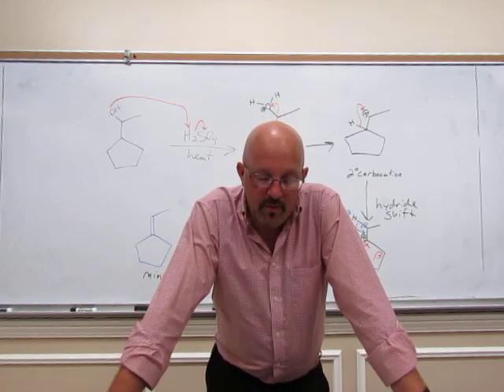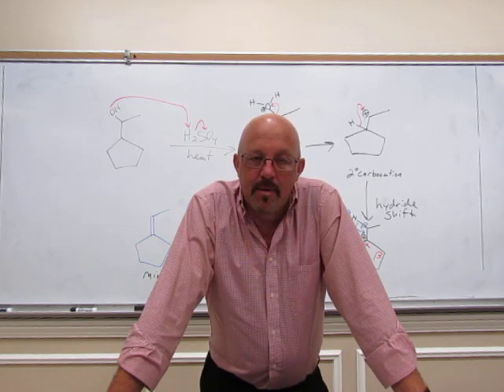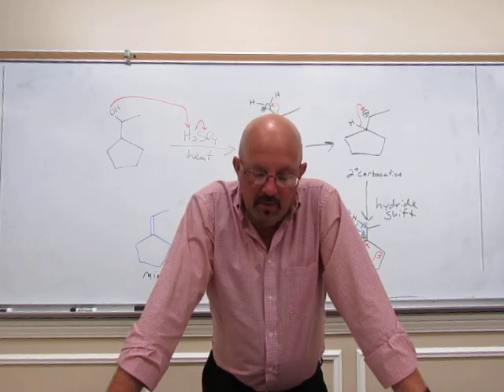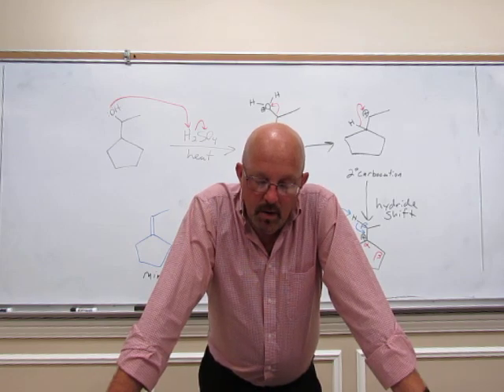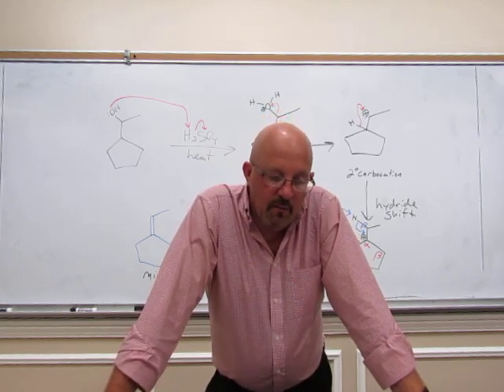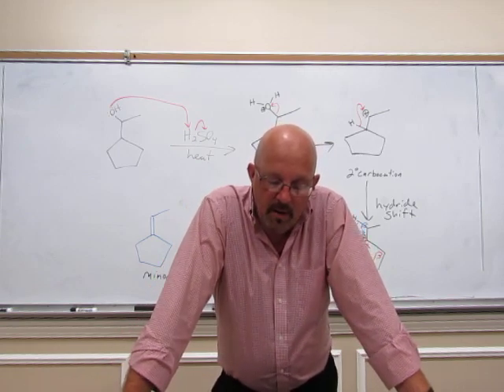Now we're adding 0.6 mL of 3 molar sodium hydroxide to the distillate. That's just in case any acid happened to distill over. So sodium hydroxide being a base, that would react with any acid that may have distilled over. Mix it well. You can do that by flicking the vial. And then you're going to draw off the lower layer. That's the water layer. Organic layer will be on top. So take a Pasteur pipette, draw off that lower layer.